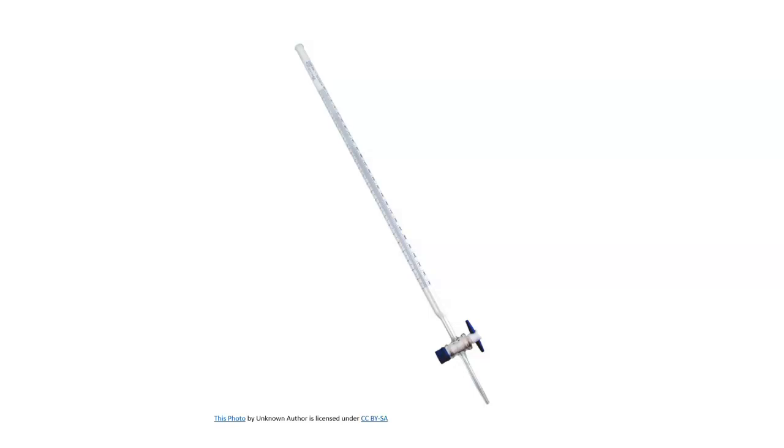And you're going to fill the burette with titrant just above the 0. You just place a container under the burette and open the stopcock briefly to fill the burette tip with solution, making sure that there aren't any air bubbles in it, and to get that level of meniscus to fall within the marking of the burette. Make sure the stopcock is in the closed position or you're going to lose your titrant, okay?